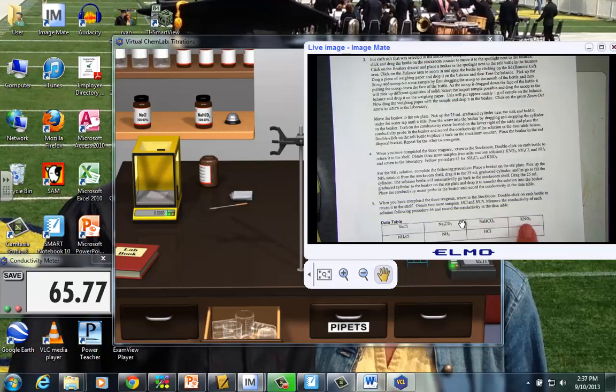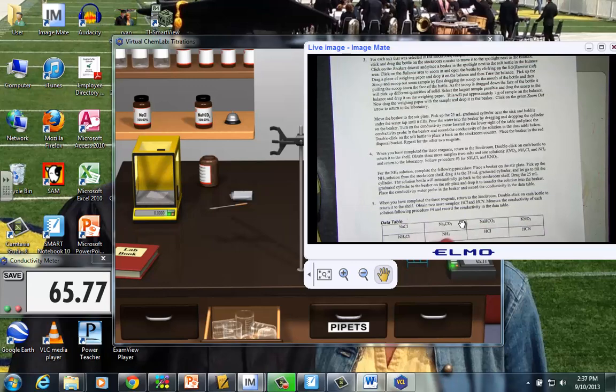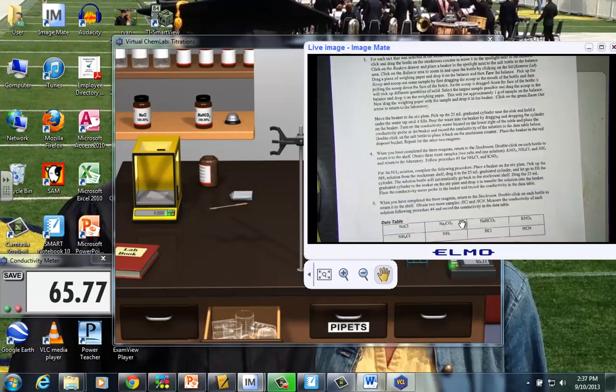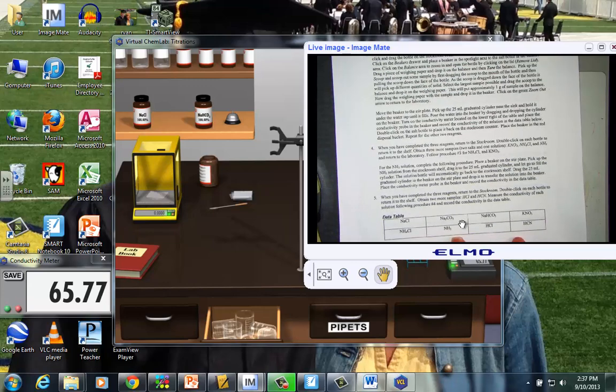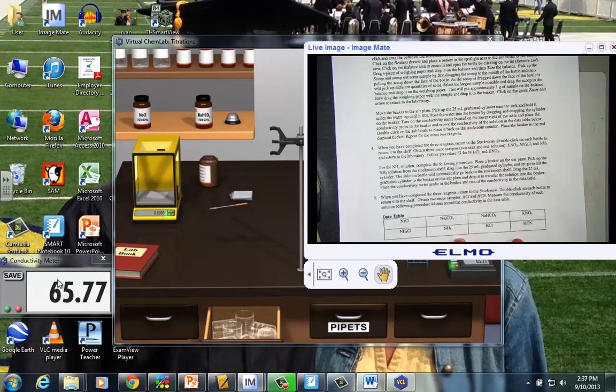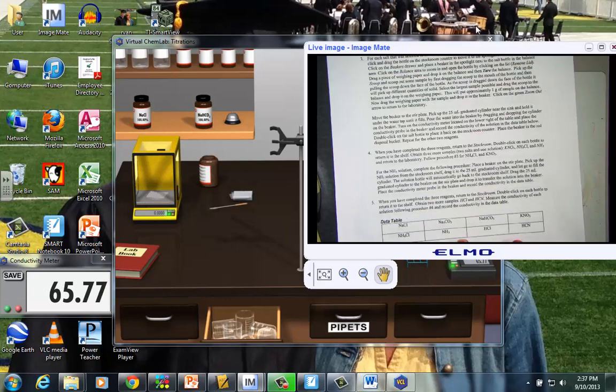And again that's the number that I'll record in this section for Na2CO3. We do this over and over testing each one of these compounds. There will be a total of 8 trials you're testing with the conductivity meter. And just simply recording the value.